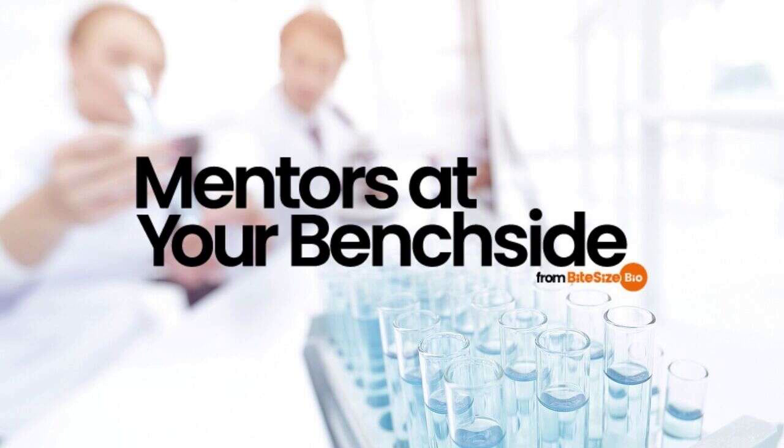Having a checkpoint near the midway point of the protocol can help narrow down where any issues stem from. And Ponceau S staining can help you accomplish this. Depending on your staining patterns, the problems may lie with your sample preparation, the electrophoresis, or the transfer. Alternatively, if the Ponceau S stain looks good, but the Western blot still isn't working, then you know to troubleshoot the latter part of the procedure, from the blocking step onwards. Ponceau S staining can be a handy step in your Western blot protocol to ensure everything is going according to plan. So that's it for troubleshooting Western blots using Ponceau S staining.